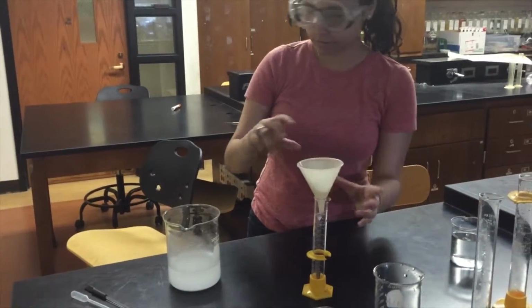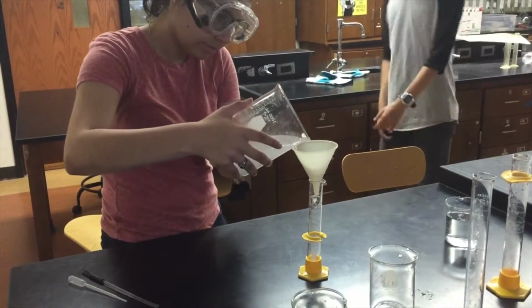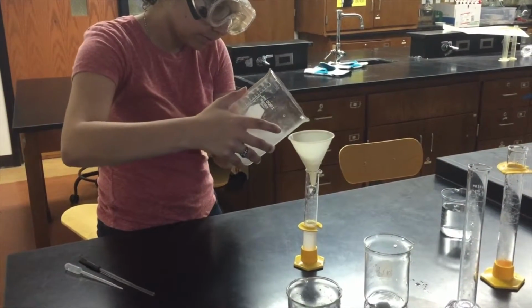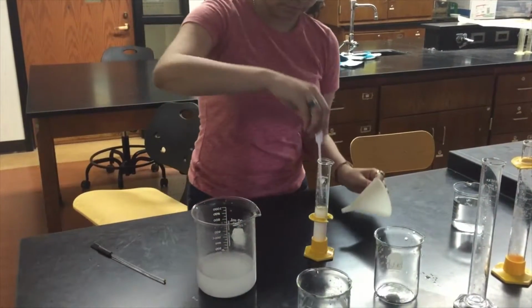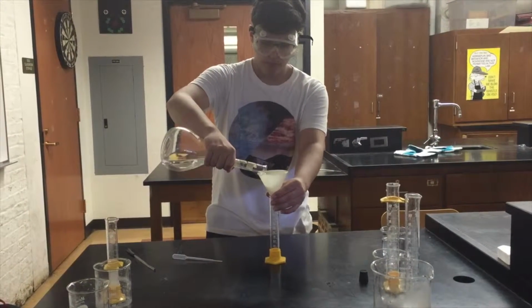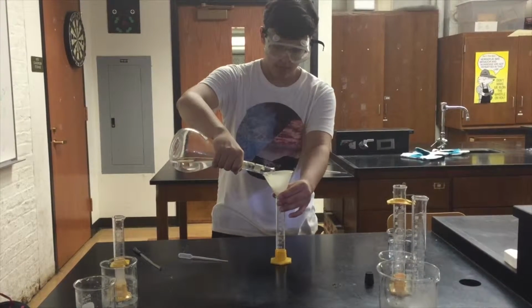Now Iris is measuring out 30 milliliters of the starch solution that we previously created. It is very important that you make sure that the starch is still soluble, as it will sink to the bottom if you let it sit out for too long. Now, after rinsing the funnel, I will measure out 30 milliliters of the sodium metabisulfite.